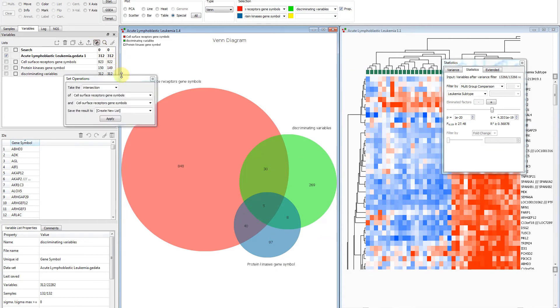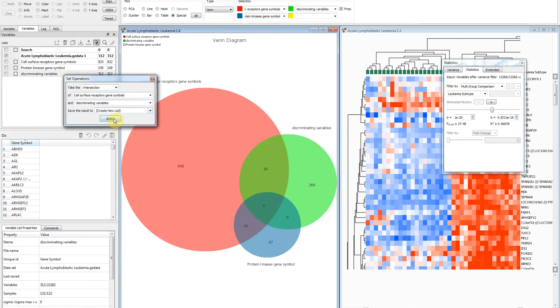The set tool complements the Venn diagram and enables creation of new lists based on set operations. For example, to get the list of genes common between the cell surface receptors and the discriminating variables, select the intersection and then the two lists.